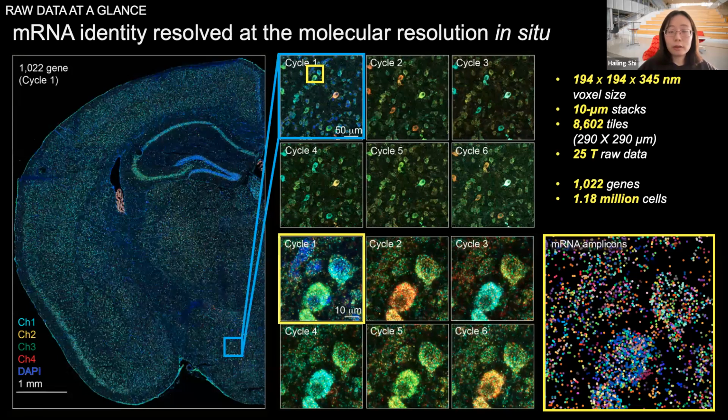Plus, if there is a more functionally related characterization purpose, say we want to understand the immune response in a tissue injury setting, or cell-cell communication, then there will be more genes about the immune response, cytokines, or cell surface proteins. I think 1,000 genes is a nice number, which gives you decent crowdedness of the dots, but also flexibility in spiking in the genes you want specifically for a certain experiment.